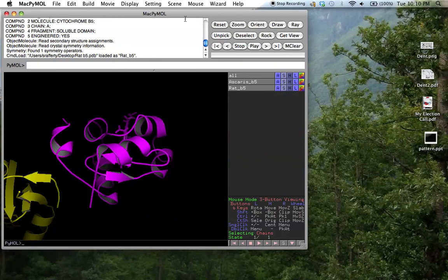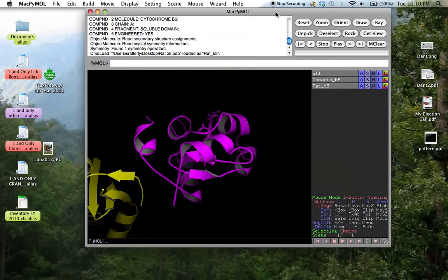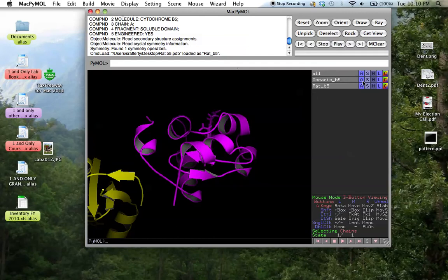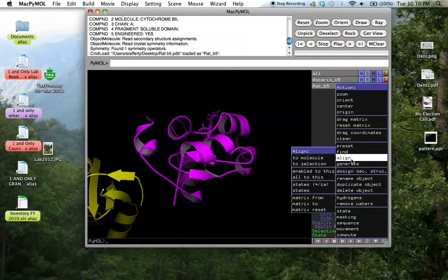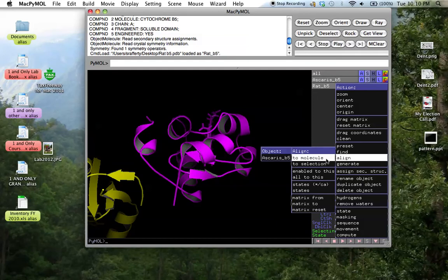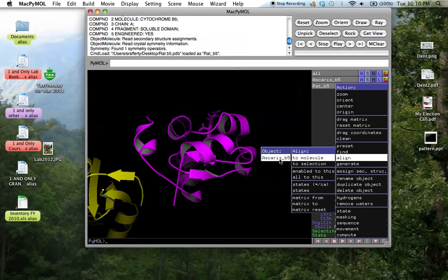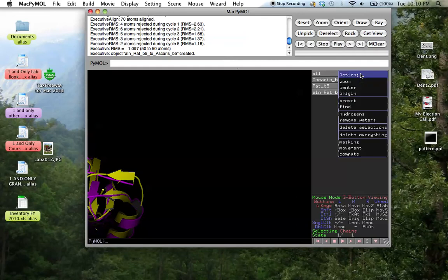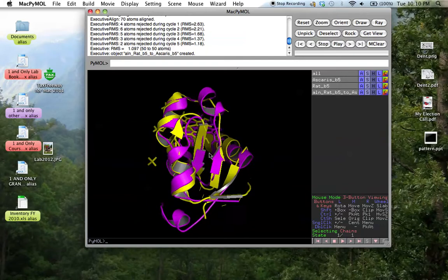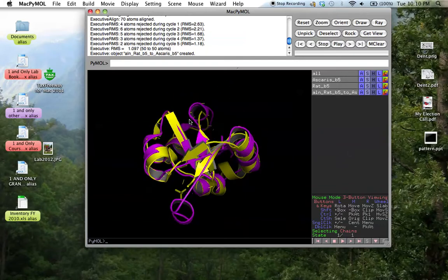Now if you want to compare the structures, you select either one of them, but use the action button, click, drag down to align, then just move across, and if there's only one choice to align it to, it will align it to that. So we've selected the rat cytochrome B5, and our choice is to align to the Ascaris cytochrome B5. So we go across to here, click, and the only thing we have to do now is to center it. So we go to all, action, center, and there you have it.